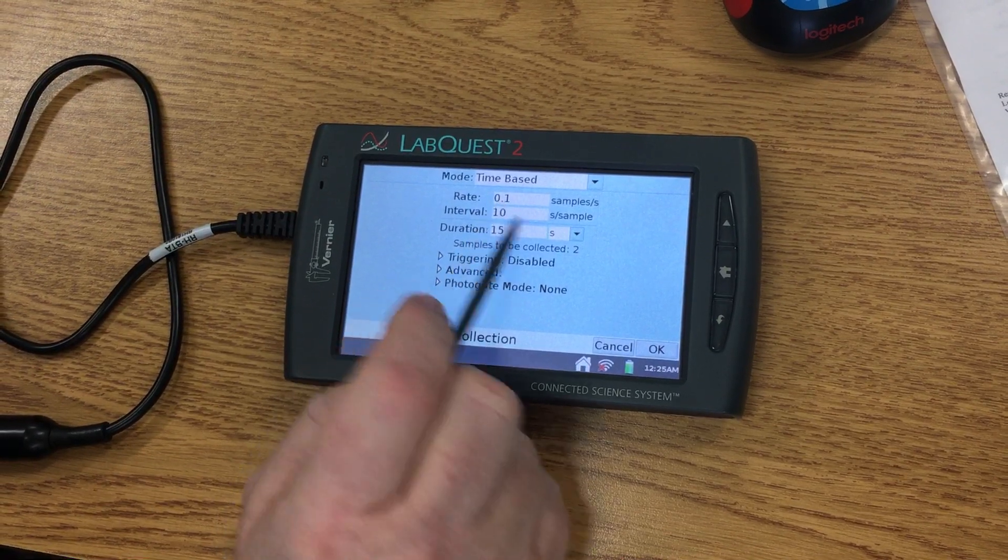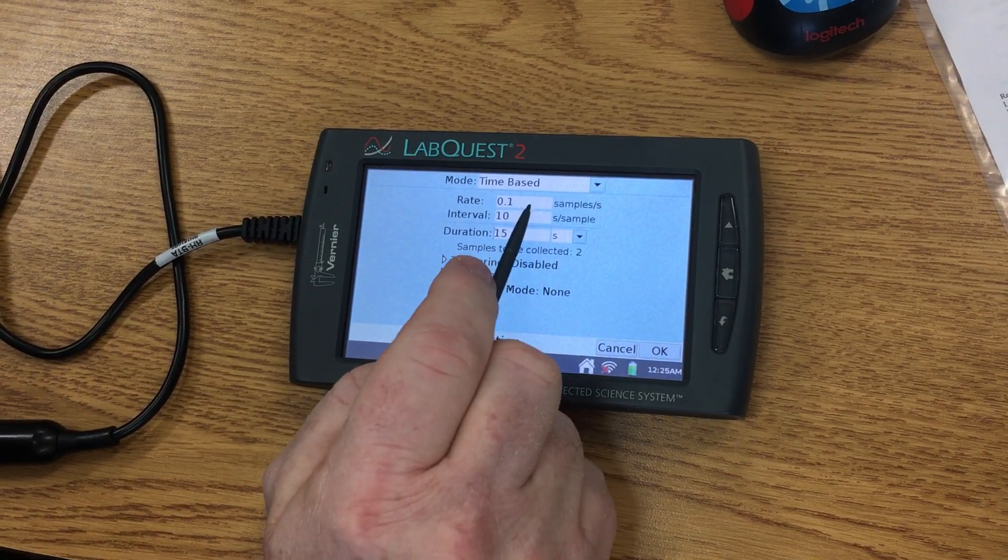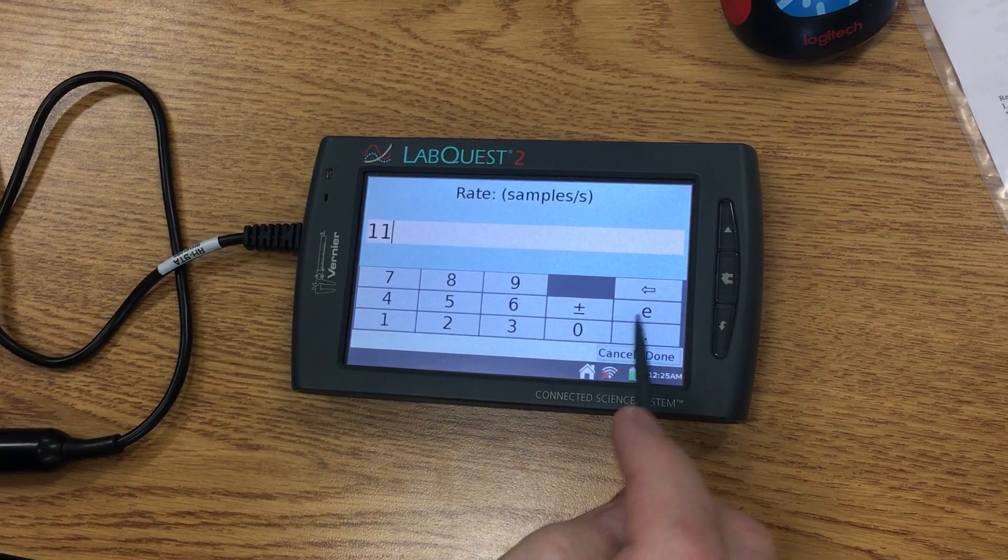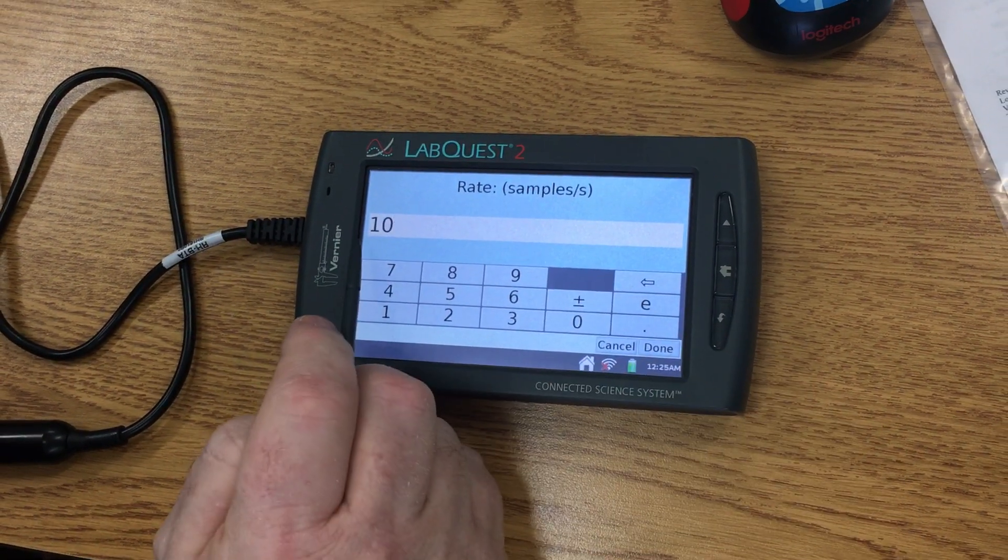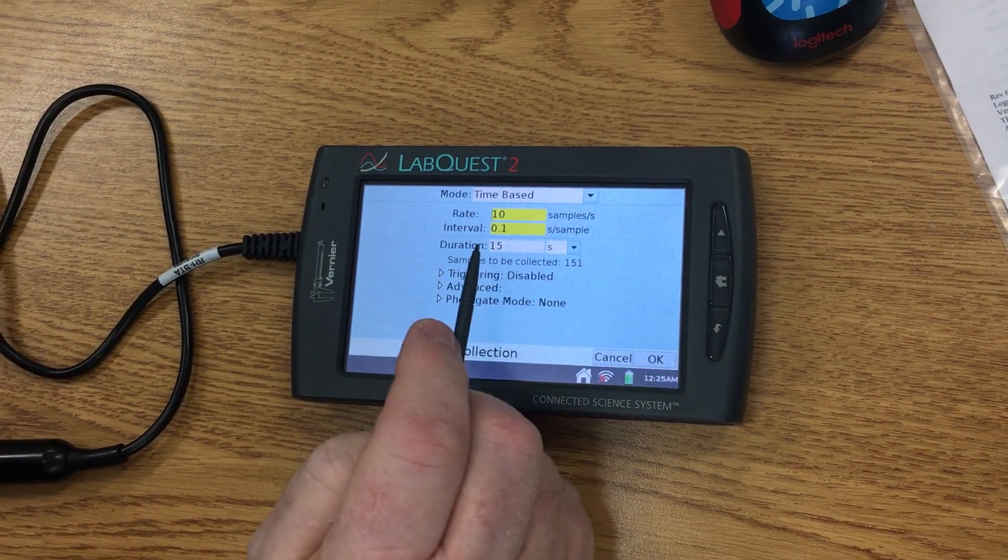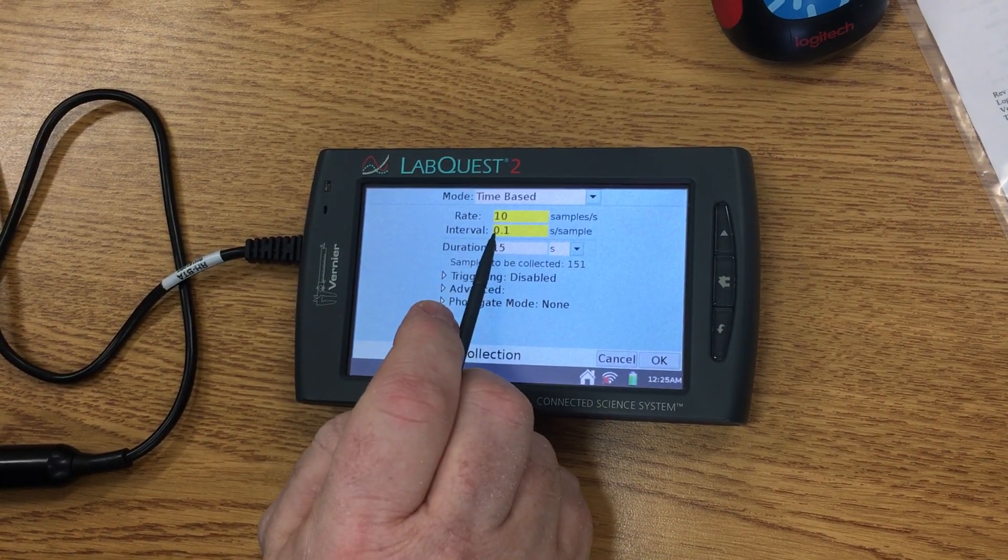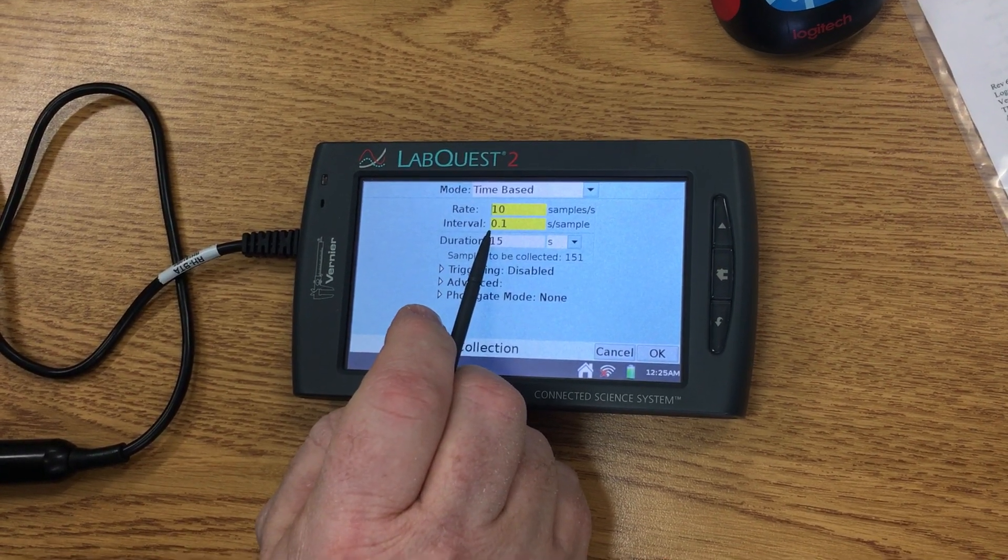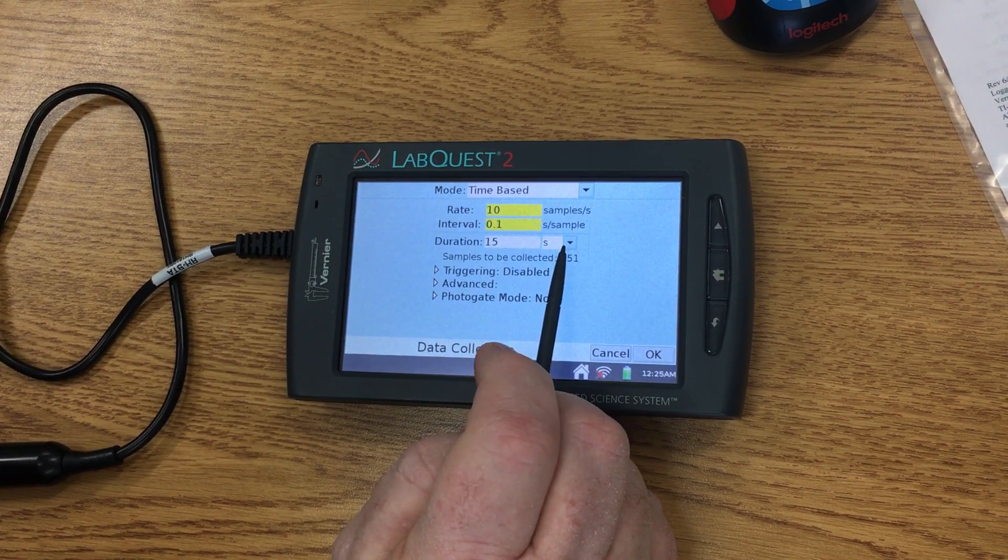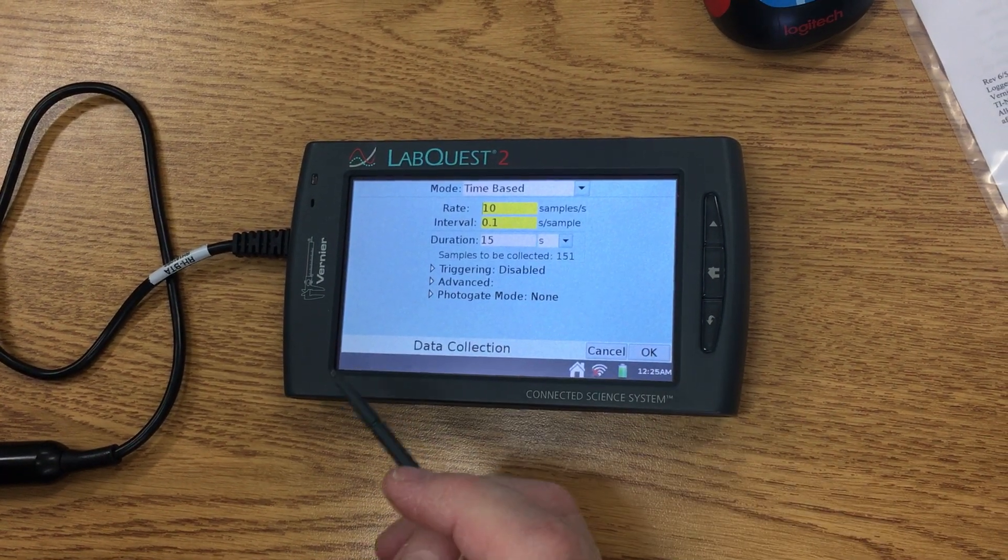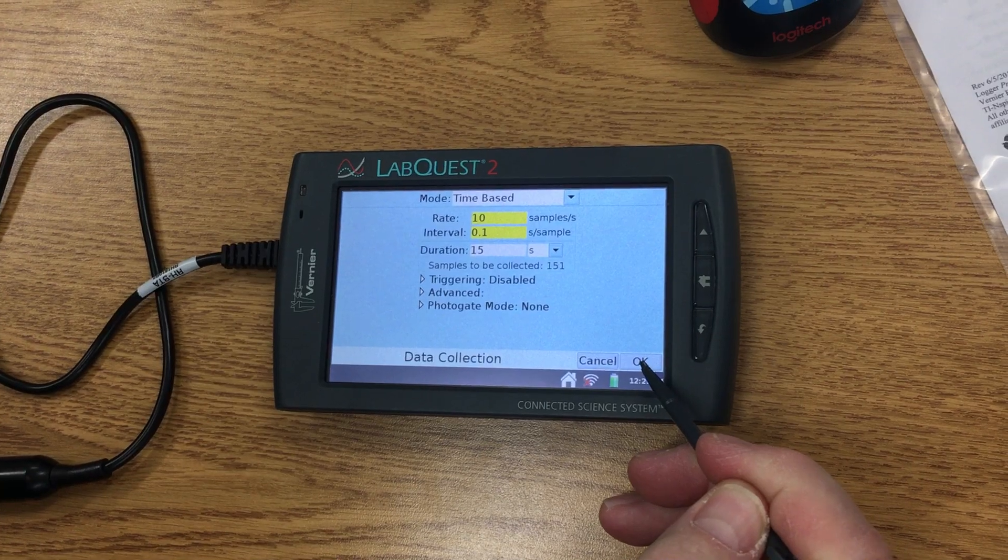So I'm going to change my sample rate to ten samples. Click on Done. This is going to collect ten samples every second, so I'm going to get a total of 151 samples during our exercise. We're going to click on Okay.